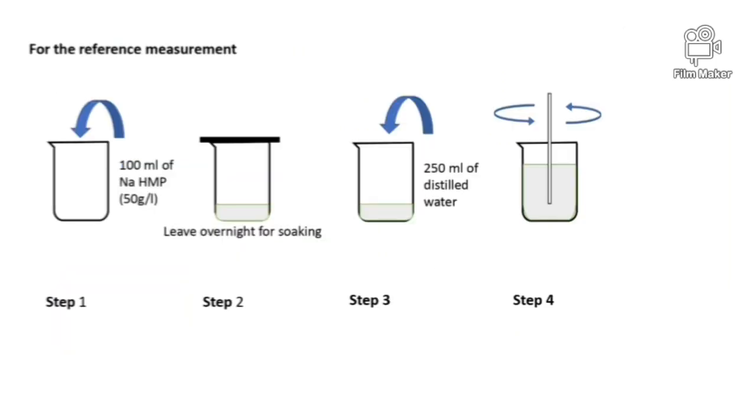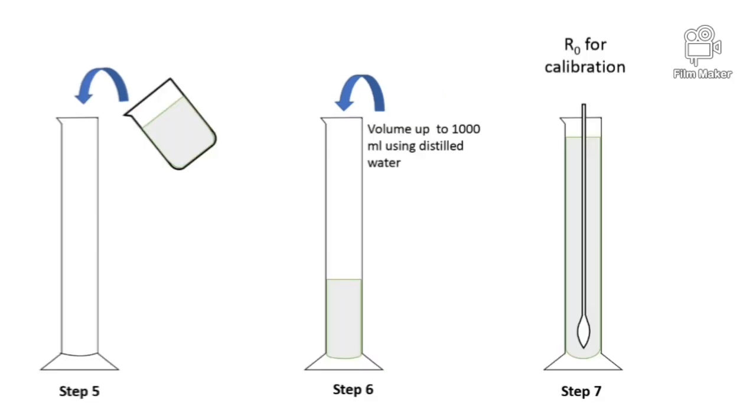For the reference measurement, add 100 milliliters of sodium hexametaphosphate and leave the solution overnight. Then add 250 milliliters of distilled water into it and stir it well. Next, add the solution into a 1000 milliliters measuring cylinder and volume it up to the 1000 milliliters mark. Then take the R0 value for calibration.